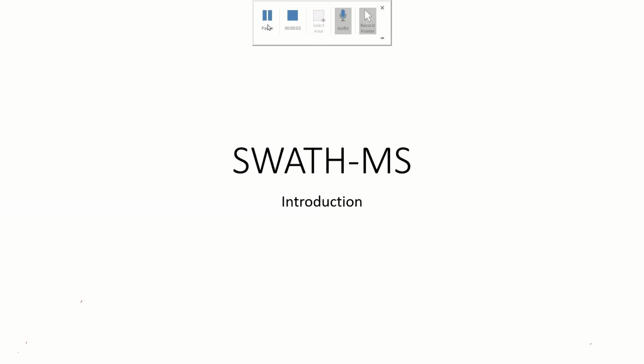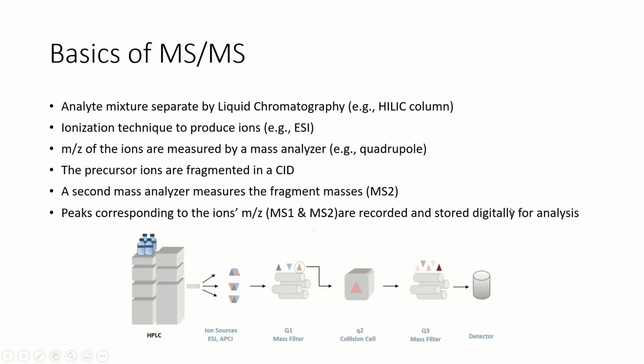Hello everyone. So today I'll be trying to explain SWATH-MS, which is a new technique of tandem MS, and I am going to explain it in a very simple, understandable way. For this, the prerequisite understanding you need to have is of basic tandem MS.